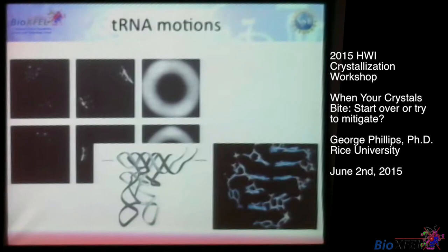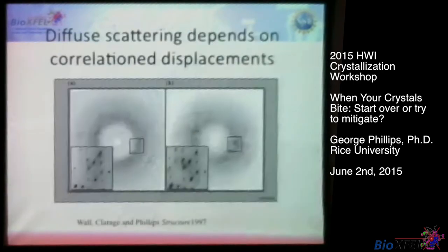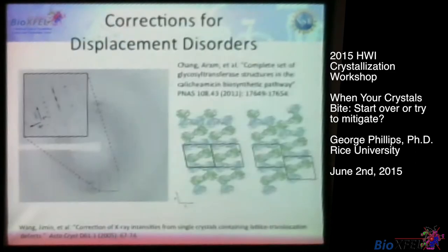So if you can get the average structure, sometimes you can learn interesting things from these crystal pathologies. Here's another one that looked at the modulation of the protein calmodulin. Calmodulin is this barbell-shaped thing that can flex, and those flexing modes are actually reflected in the properties of the lattice. This is an experimental, this is a calculated diffraction pattern where we accounted for these. So again, this assumes that you've got the basic structure solved. Otherwise, these kinds of pathologies can be a real problem.